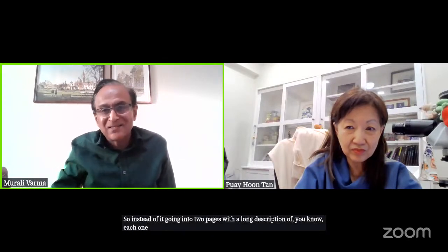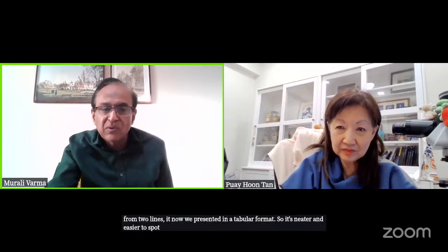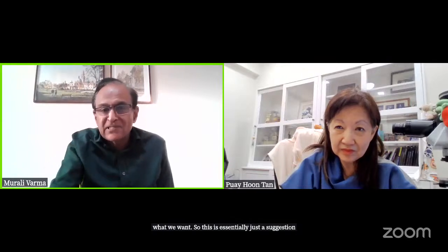But the key point is they have to give us that information, and I think that information should be there in our report. So this was our mechanism of doing it, and for us, the other big advantage of doing it this way is that it is now tabular. Instead of going into 2 pages with a long description of each one, it's now presented in a tabular format. So it's neater and easier to spot what we want. This is essentially just a suggestion. Again, it's purely a suggestion.